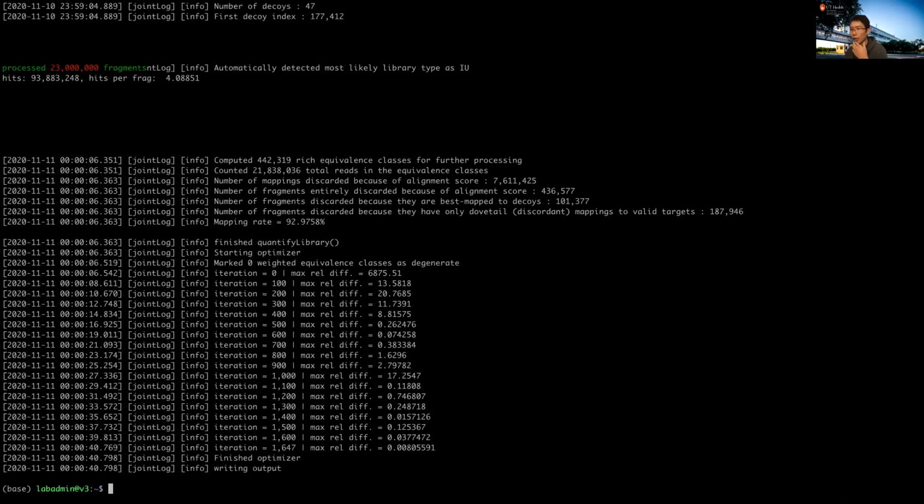Okay, so now Salmon is done from my end. I'm not sure how you guys are doing. So let's see.